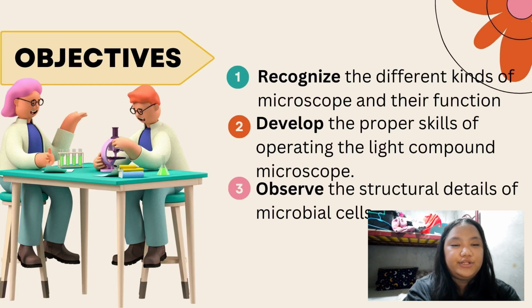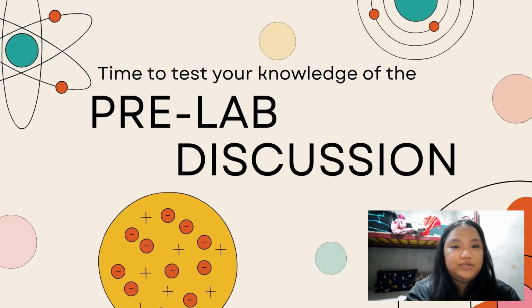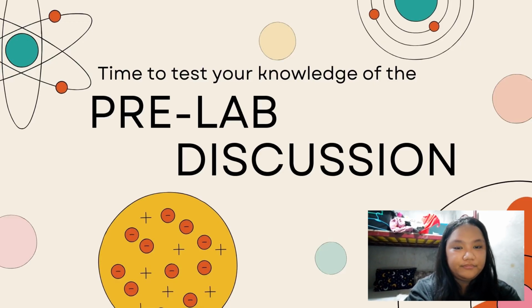Also, we have here three objectives. Number one, recognize the different kinds of microscope and their functions. Number two is to develop the proper skills of operating the light compound microscope. And lastly is to observe the structural details of microbial cells. So for the pre-lab discussion, Miss Audrey will be taking over.